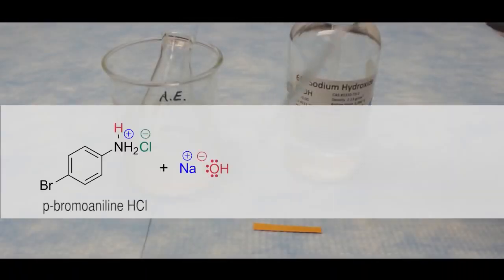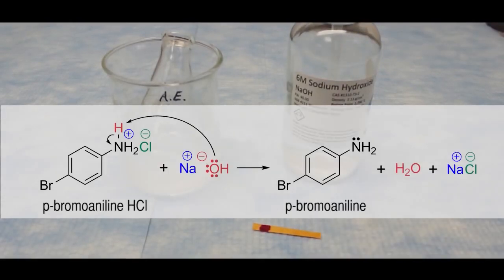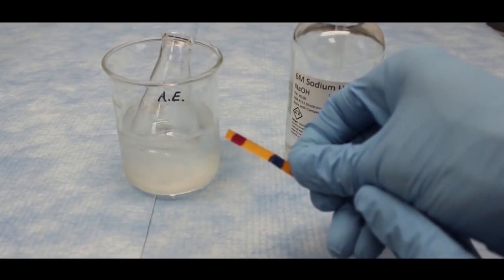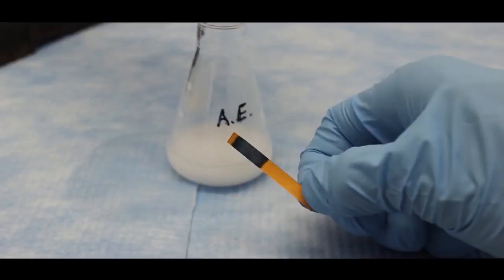Similar steps are used to convert the p-bromoaniline HCl salt back to the free base form. In this case, 6 molar sodium hydroxide is used instead of the 6 molar HCl. And when addition of the sodium hydroxide solution is complete, the acidic extract should have a pH of about 10.